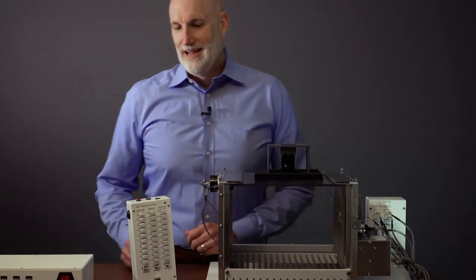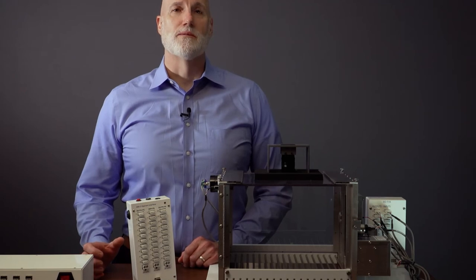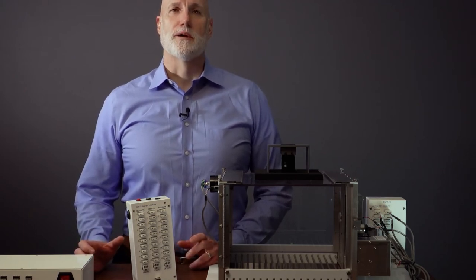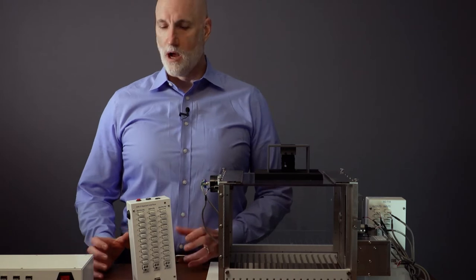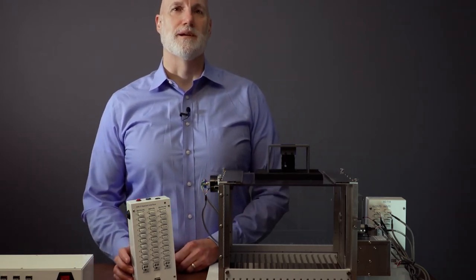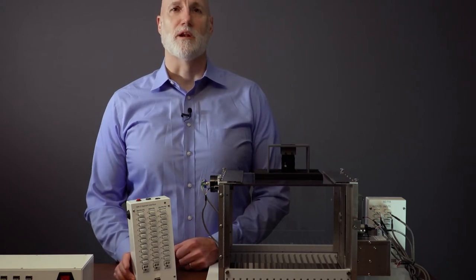All 3 of these devices will be set up the same way within ANY-maze. Although we'll be focusing solely on MedAssociates here, know that Coulbourn and Lafayette instruments will be configured the same way within the software.